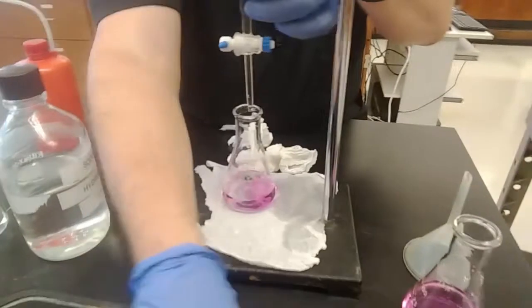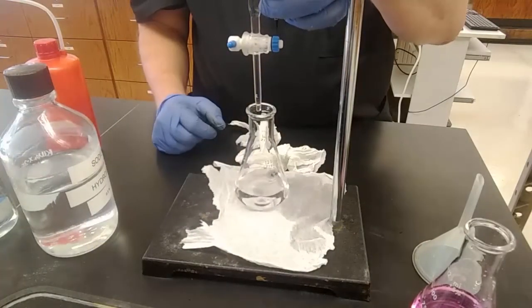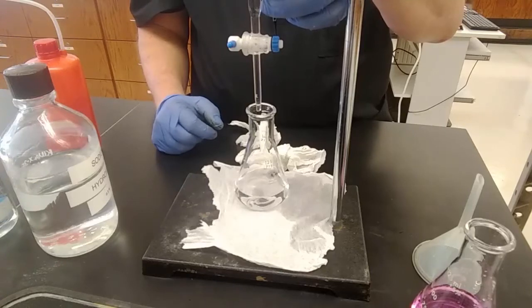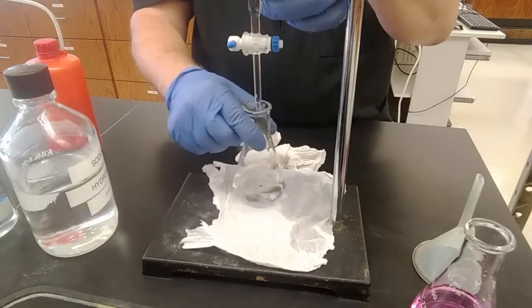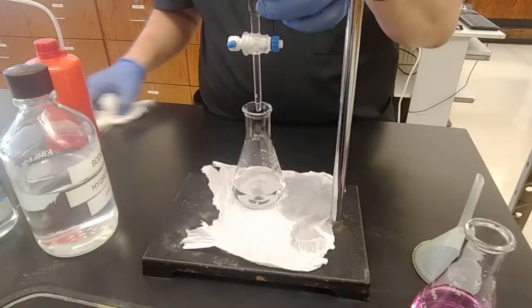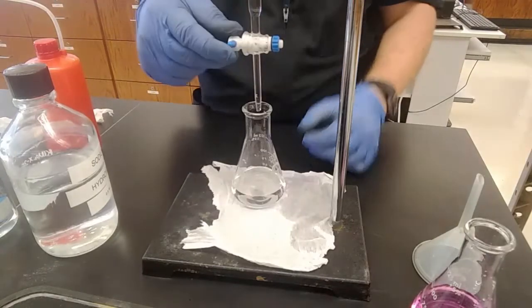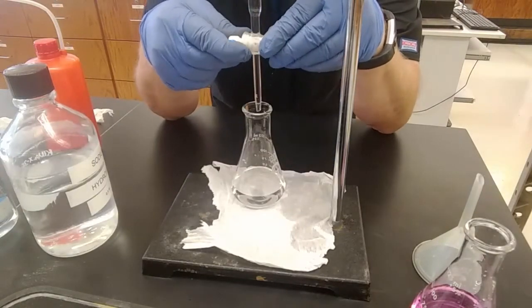Now you might think, oh my God, it turned pink. You missed it. Awful. But look at that. Science doesn't lie. Data can be misrepresented, but chemistry is chemistry. I knew how much was going to be in there based on my first 2 titrations. So now I can go really, really carefully at the end, just like I did last time.